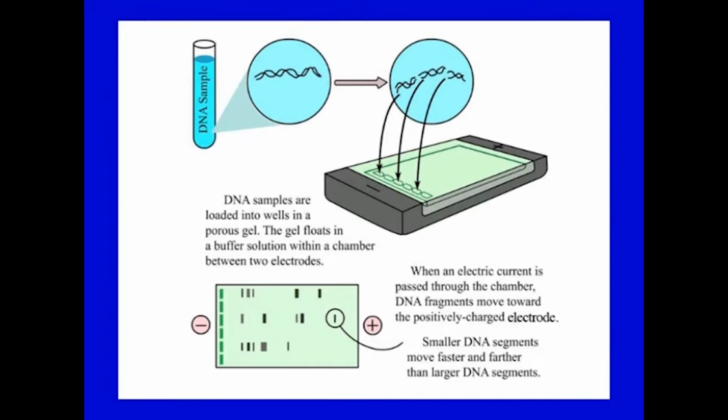You can analyze this in a UV illuminator, or you can even cut the gel and extract the DNA. So, agarose gels are used for electrophoresis of mostly nucleic acids, but you can also use them for proteins.